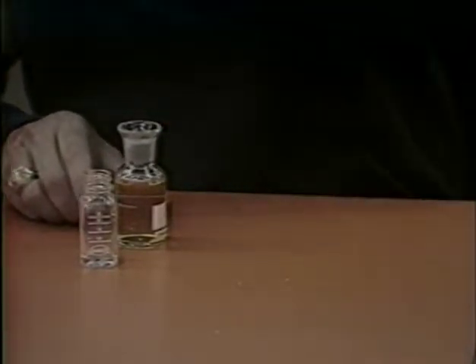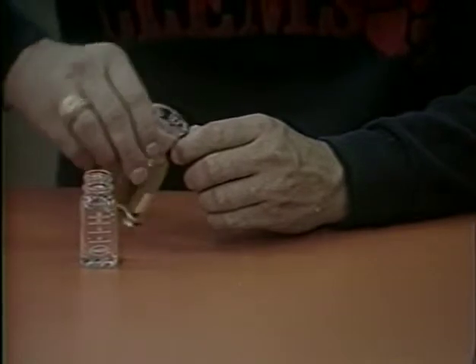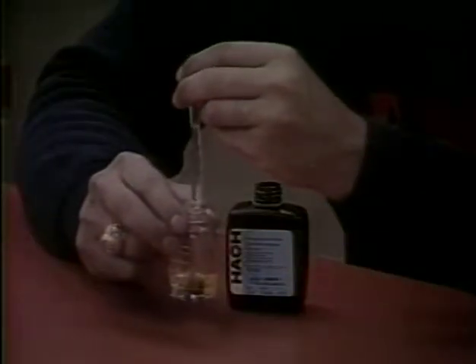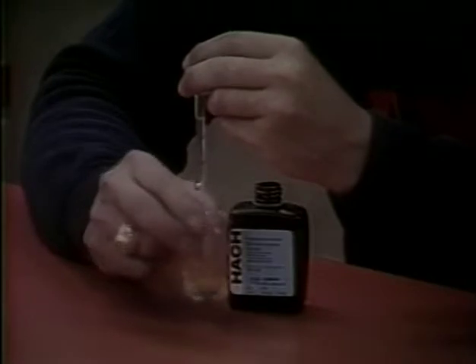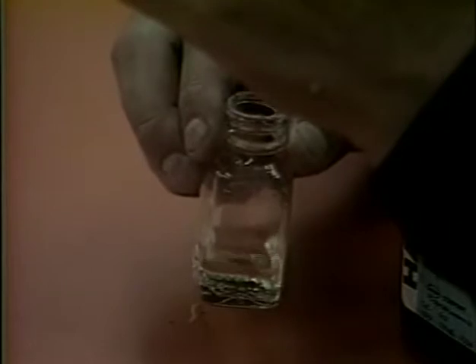Rinse the plastic measuring tube with the sample, then fill and pour the contents into the mixing bottle. Add PAO standard solution drop by drop to the contents of the mixing bottle. Swirl the mixture after adding each drop while dispensing the drops with the dropper directly above and vertical to the mixing bottle. Add until the color changes from yellow to colorless. Be sure to count the number of drops while adding them.